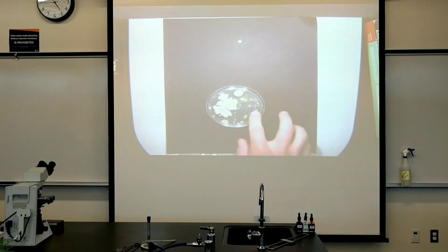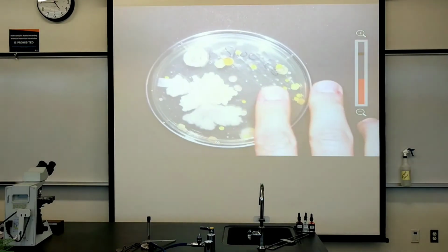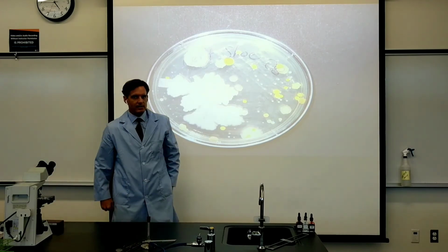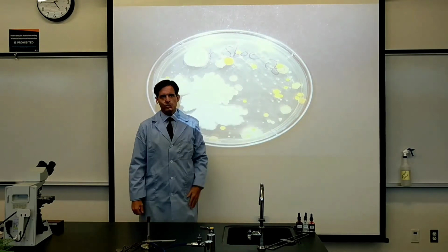And what are we seeing here? This is labeled my shoe. It looks to be about the same as before, but the colonies are larger. And I was mentioning as well that the pigments are much brighter.